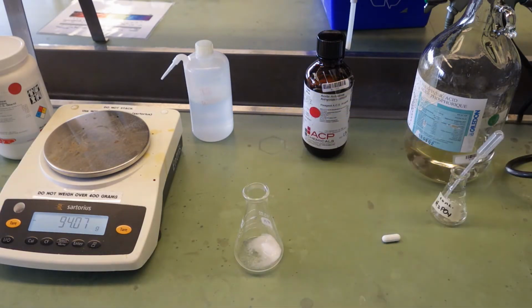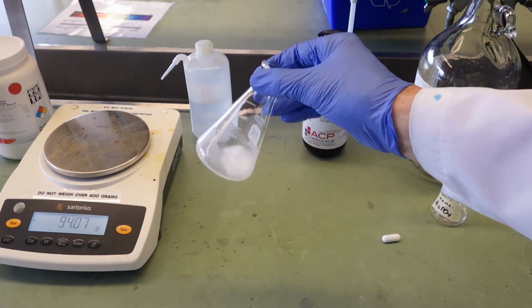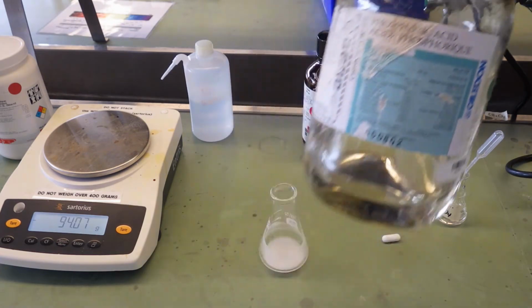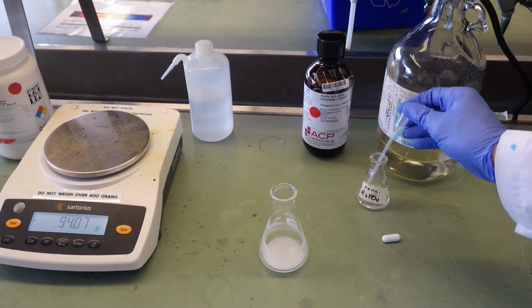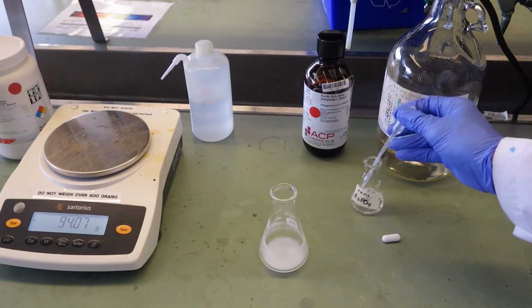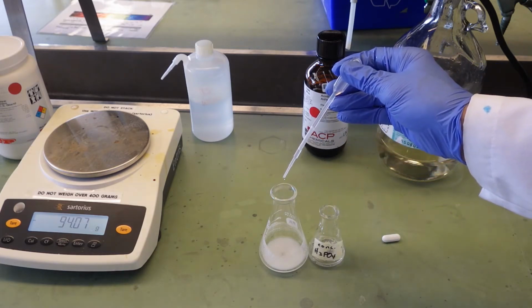Our next reagent is a catalyst, conc phosphoric acid. When you weigh a catalyst, you don't need an exact quantity. Here it is, conc phosphoric. So 5 to 8 drops should be good. And anytime you're going to transfer with a Pasteur pipette, make sure that your flasks are as close as possible, like this, so you minimize spilling. And if I had 2 hands free, I'd hold the 2 lips right close together.